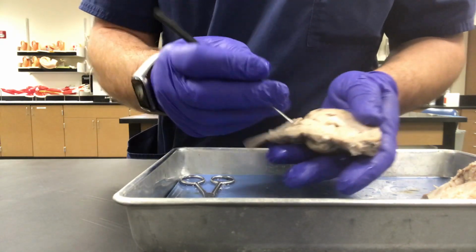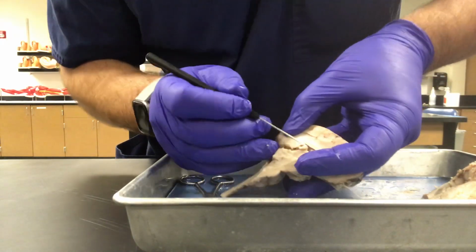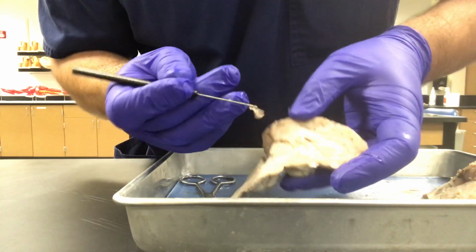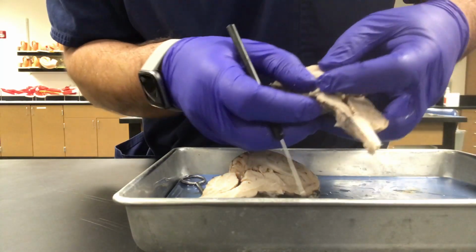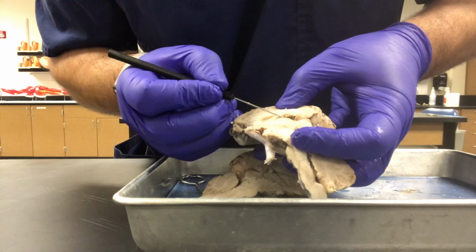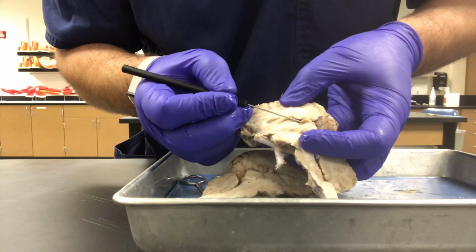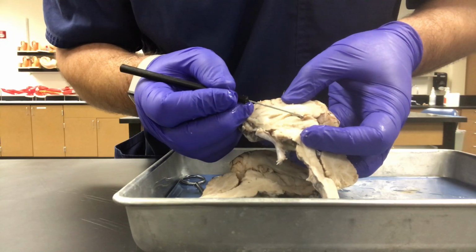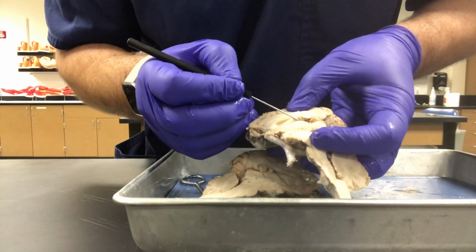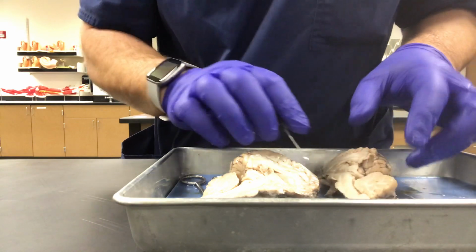And that's something else that you can kind of see. If you open up the inside of the brain, you go in this area. I kind of took some of it out. Let's see if I can see it. Oh, I can see a little bit better on this side. There's some darker tissue that you can see right there coming out of this, and that is going to be associated with, oh, why am I forgetting the name? Choroid plexus. There it is, choroid plexus. And that's it for the inside of the brain.